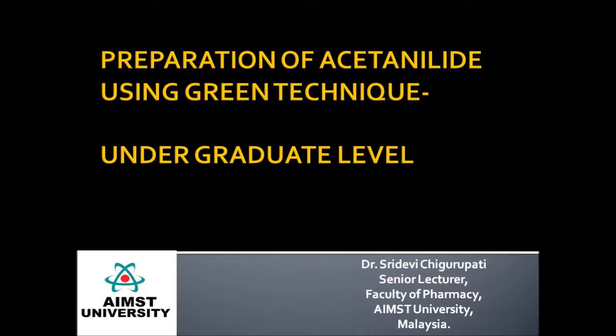This is a technique where we apply the greener procedure compared to the conventional procedure. It is the experiment which is mainly taken into consideration for undergraduate level students. So let us start how we can prepare the acetanilide using the greener technique compared to the conventional technique.